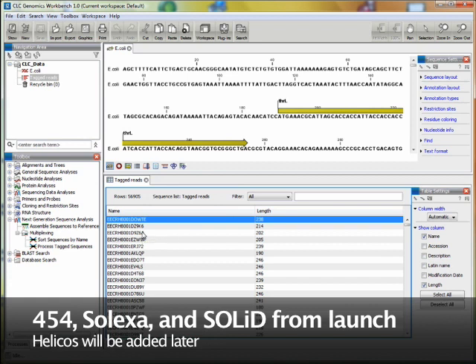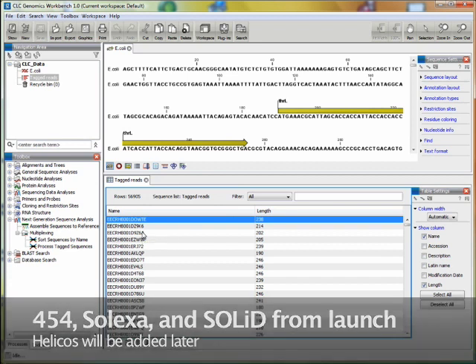Because of the huge throughput of the NGS machinery, you'll often be doing several experiments on the same run. A common thing to do is to insert tags in the DNA to identify which experiment each read belongs to.